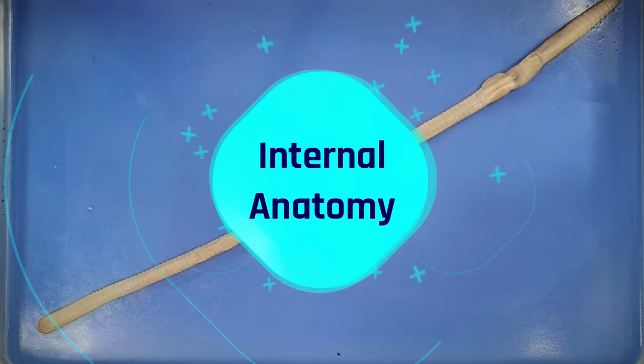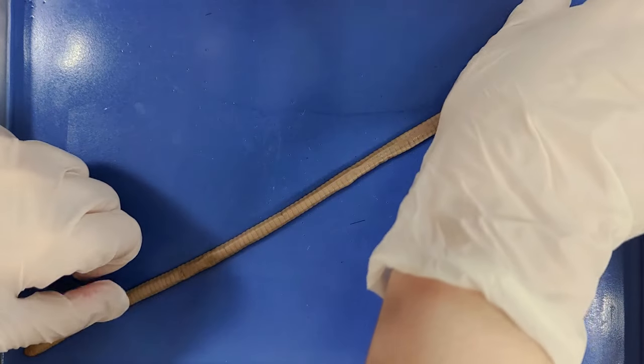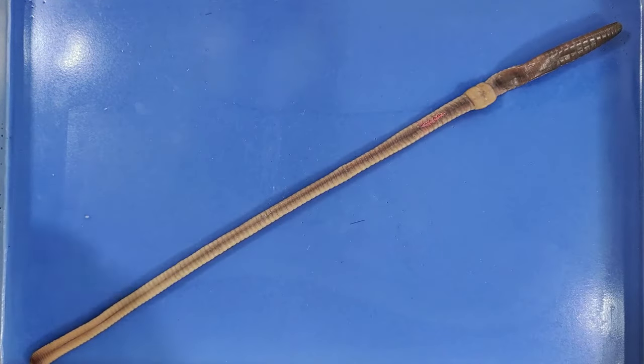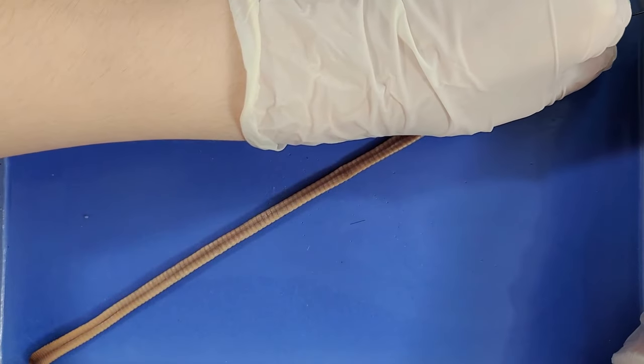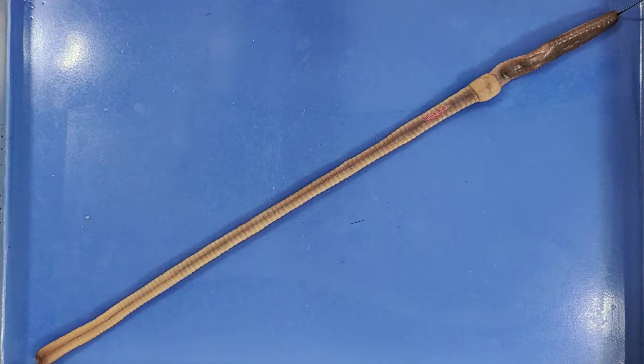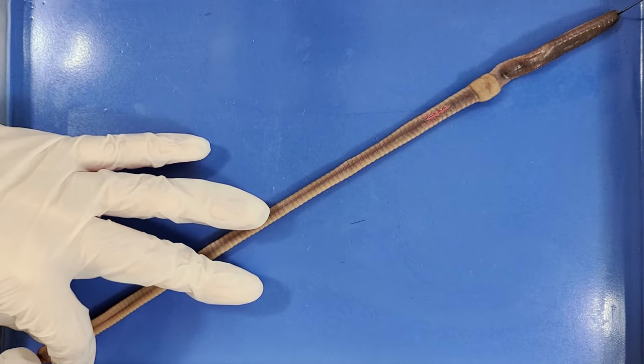Now let's take a look at the internal anatomy. Make sure the worm is placed so that the dorsal side faces up. Then pin the worm diagonally across the dissection tray at the head and at the end of the tail. This makes sure that the worm doesn't move around too much when we dissect it.